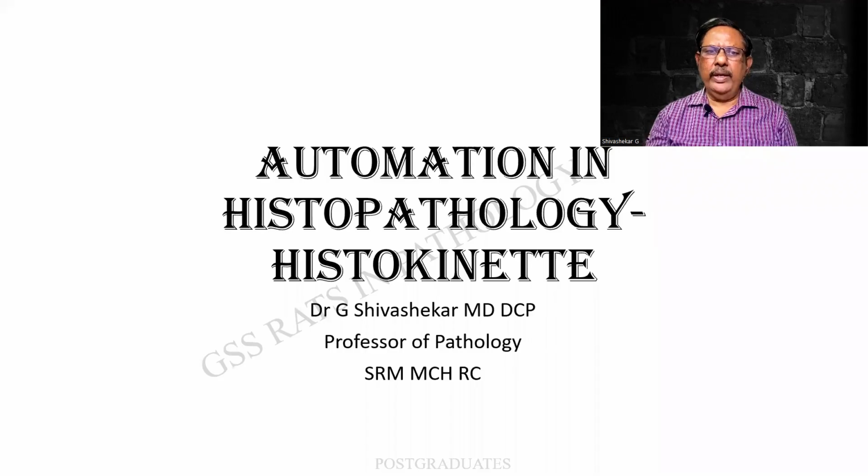The class for today is Automation in Histopathology, and the component I shall be dealing with is histokinette. This has been a repeatedly asked university question, and even otherwise, it will hamper us a lot if we do not answer this fluently in our viva at the practicals.